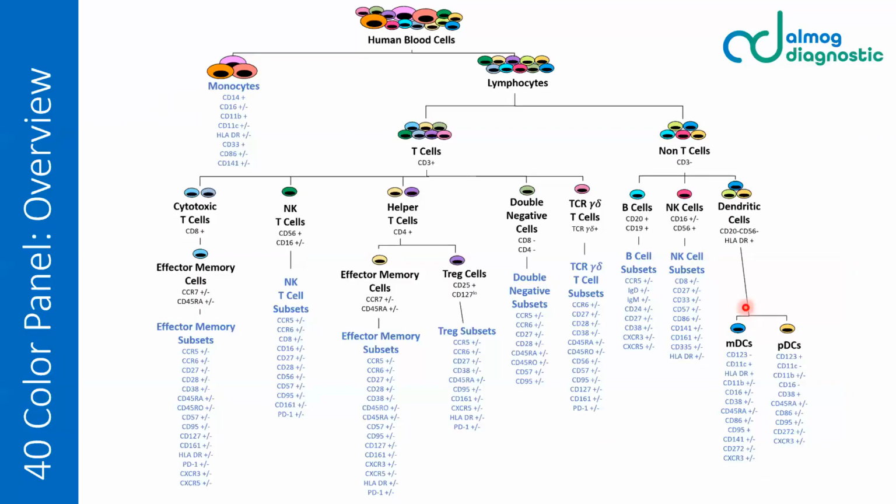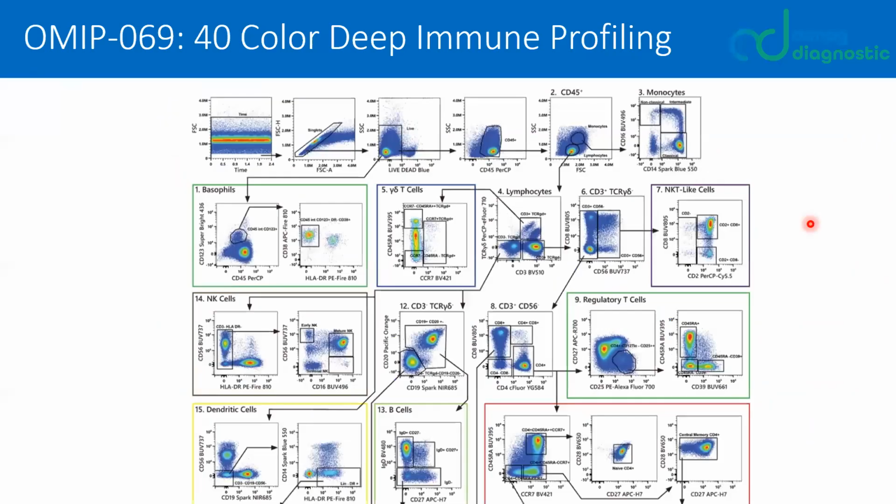So there is another way to look at the panel. Here are the immunophenotyping markers for all the cell populations that had been chosen. And here we can see the outcome of the analysis. So this is the classical way to analyze this data with density plots. And of course, we get this nice analysis for monocytes, for non-classical, intermediate, and classical monocytes.